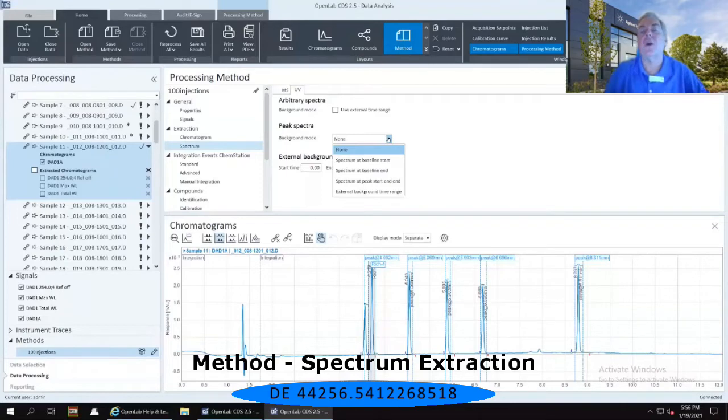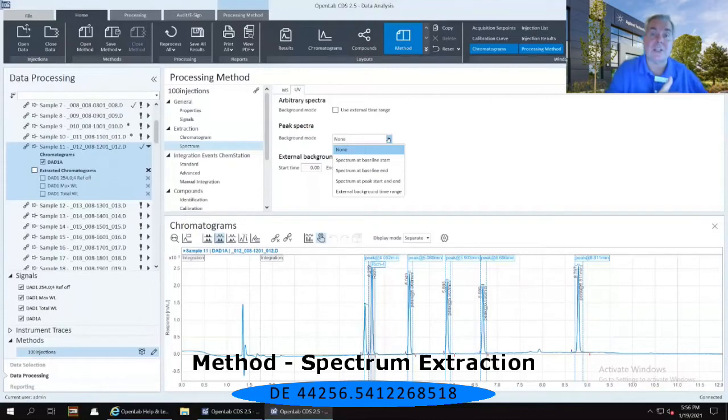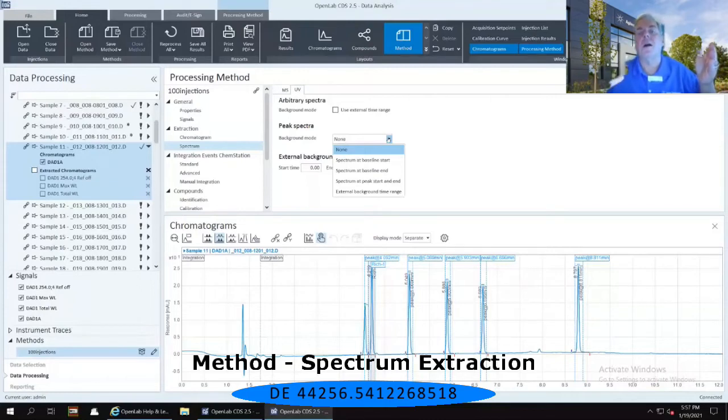It's going to take that background spectra and subtract it from any of your analysis spectra in any of your injections.